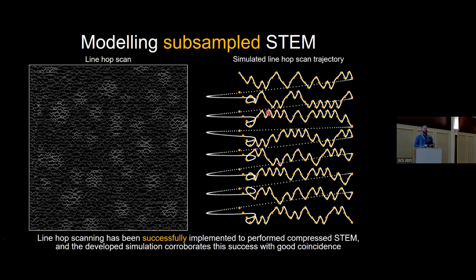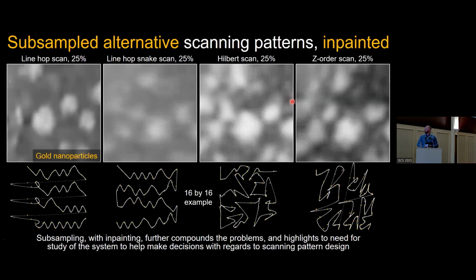This is a valid answer. We actually get decent cohesion between the scan coordinates and the beam. So we obviously can go into a lot more detail on why this is the case at a later date. But right now we can validate that, okay, the choices made arbitrarily were actually quite fortunate and very well chosen. They did their due diligence.